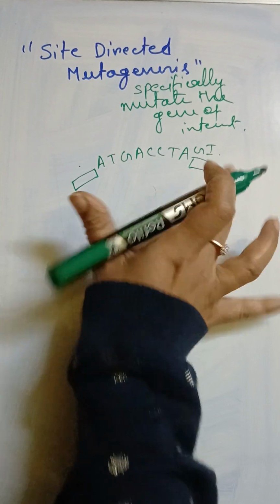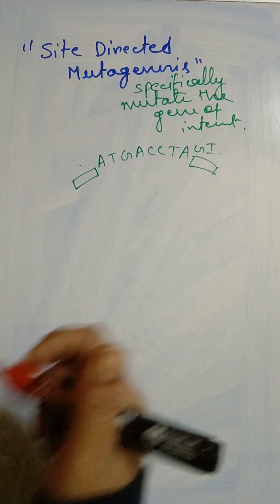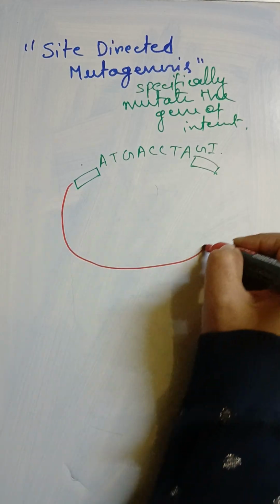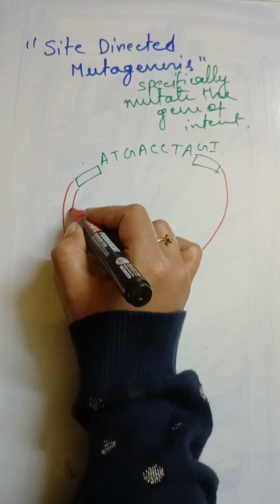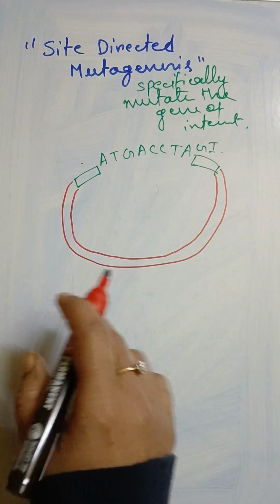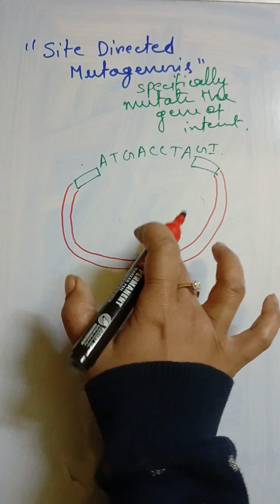This gene of interest is now cloned into another thing, that is a plasmid.